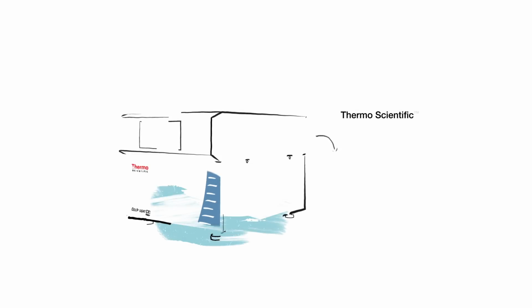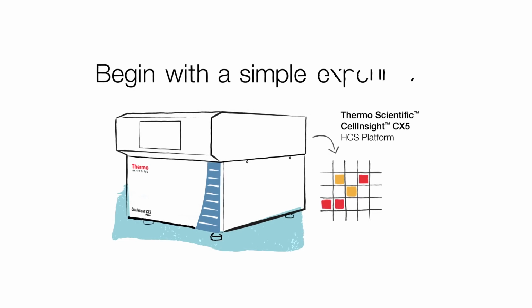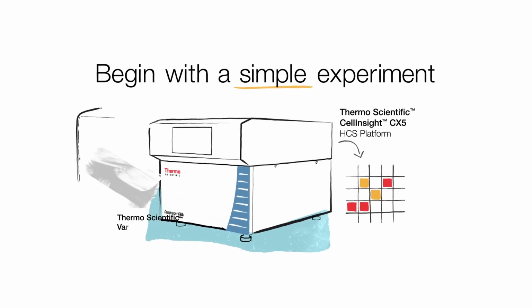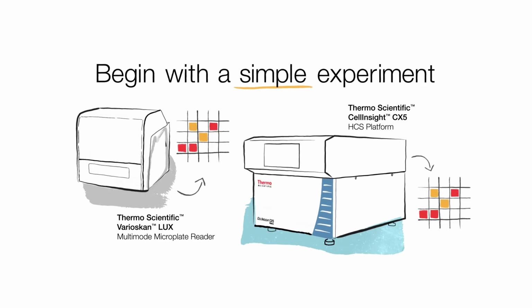You should have no problem adapting to high-content analysis if you follow this simple rule. When learning how to use the platform, begin with a simple experiment where you already know the outcome. The platform should report parameters you are used to seeing with other technologies.